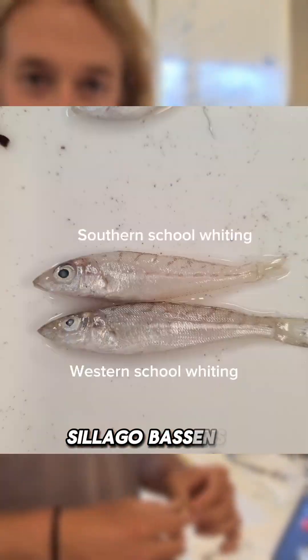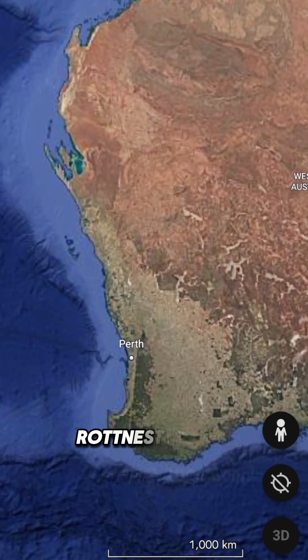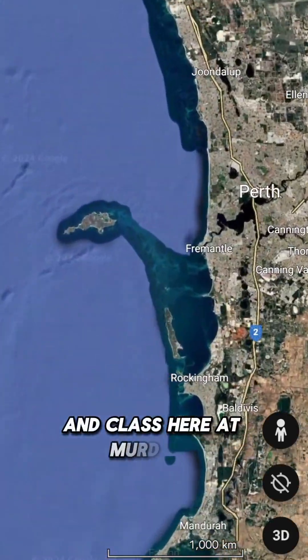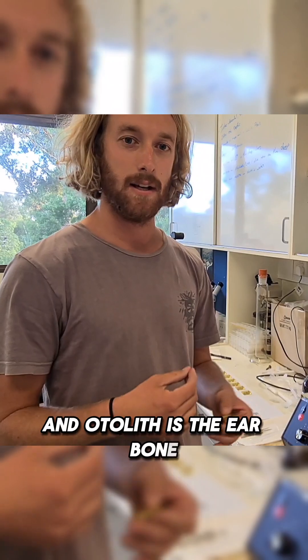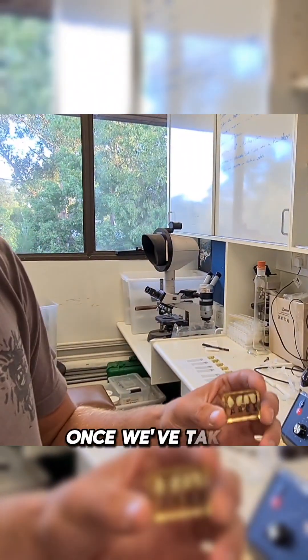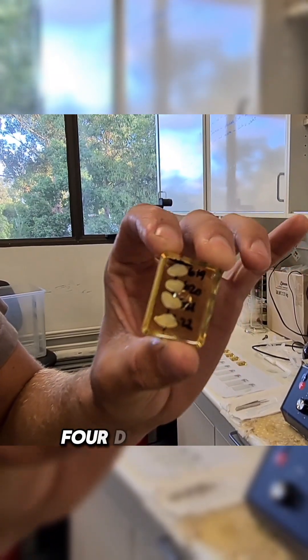The fish we're ageing is Sillago bassensis, which is the southern school whiting. These fish were caught off Rottnest Island, and a class here at Murdoch sectioned the otoliths out. The otolith is the ear bone inside a fish. Once we've taken the otolith out, we've put it inside some resin — we've got four different otoliths, so that's four different fish.